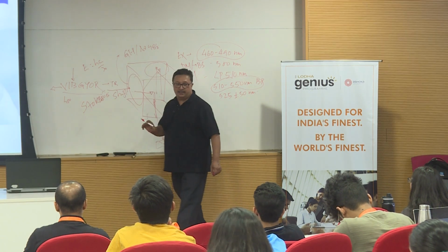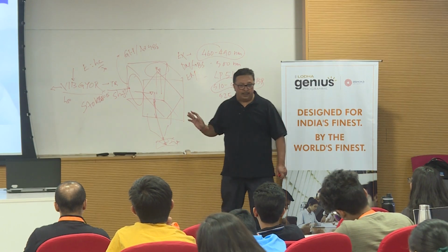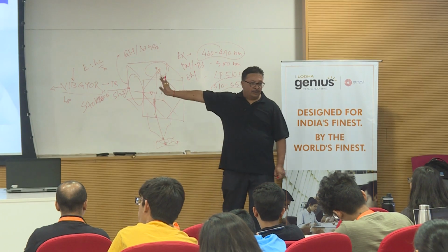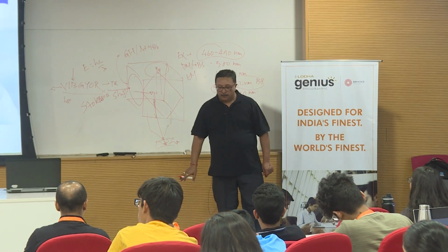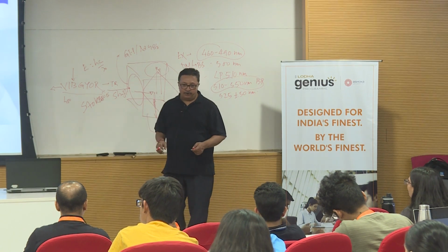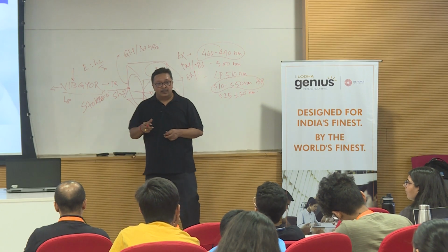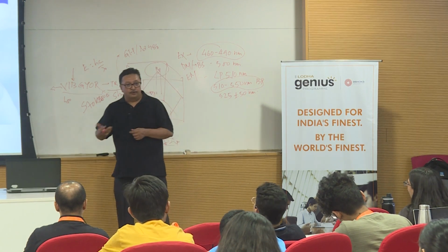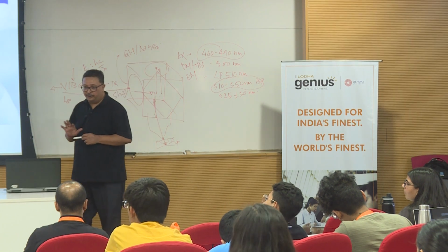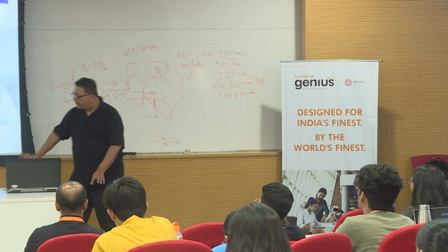And this is the basis on which any fluorescence microscopy functions. Forget about brand, forget about which model. Any basic fluorescence microscope concept will be based on this aspect. A slight modification and you get into confocal. So first of all, let's understand why confocal. What is the difference between a regular fluorescence microscope and a confocal? Anybody? Any idea on the confocal till now? No. Okay, very good. So, forget about that.